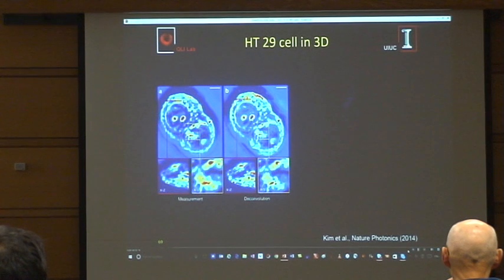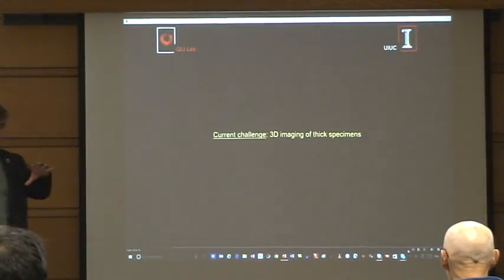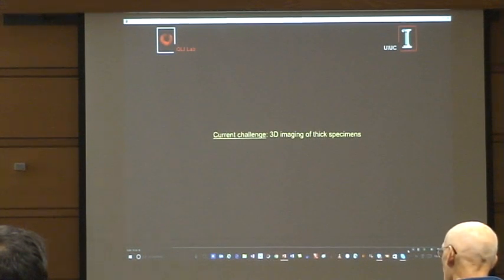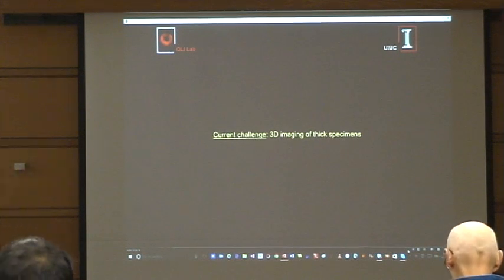Anyway, the whole thing started to look like a confocal image, except that this cell is not tagged, it's not fixed, it's happy, alive, and so on. So there is a lot to be improved here. We're working towards that, but I think it's very promising that we could do one day just 3D plus time imaging without killing them. So again, indefinitely. Do all that transport stuff that we're doing in full 3D. That's kind of our view.